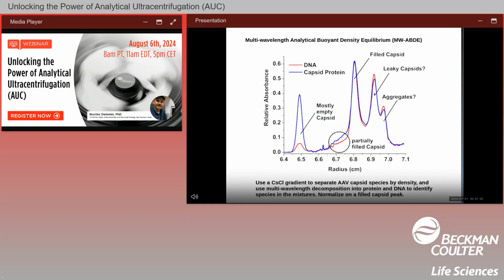these experiments by complexing DNA with cesium ions that are in the mixture, making the capsids even more dense than the filled capsid, which should be our highest density species, because the DNA gives rise to a more dense particle when compared to the one where there's just protein present. But we do get two additional peaks here, which are often seen when you measure molecules in cesium chloride.